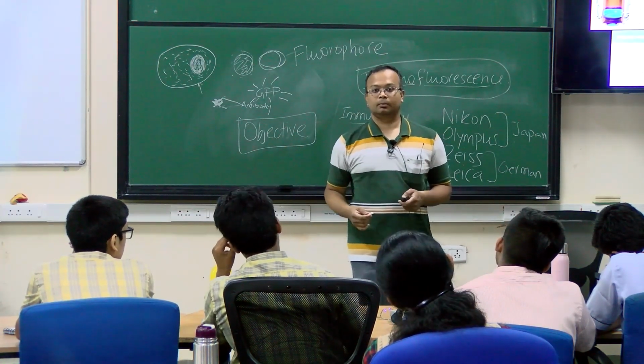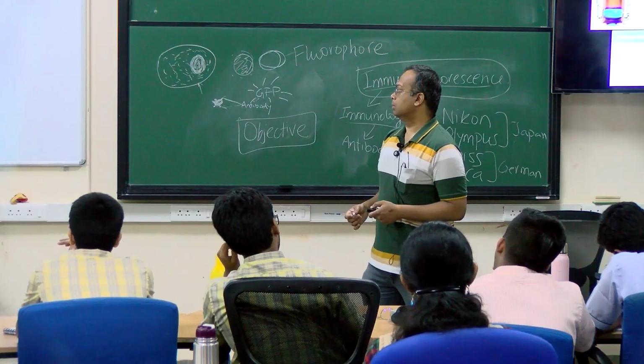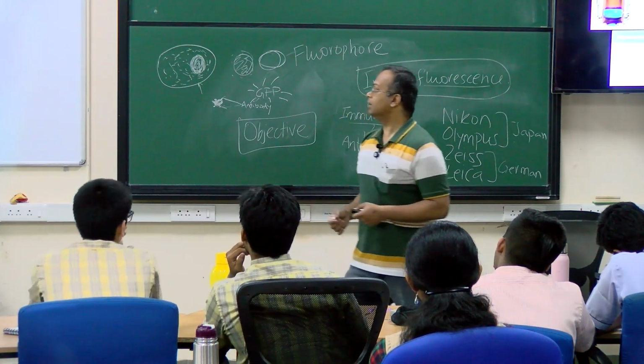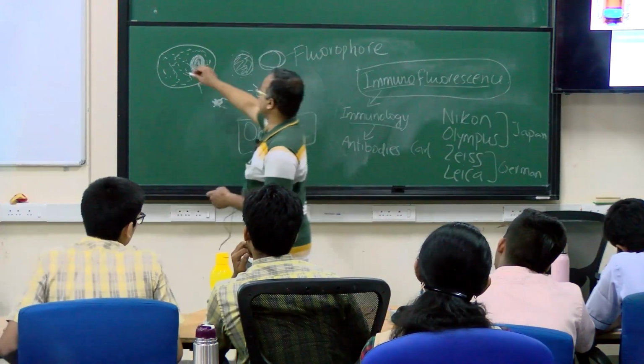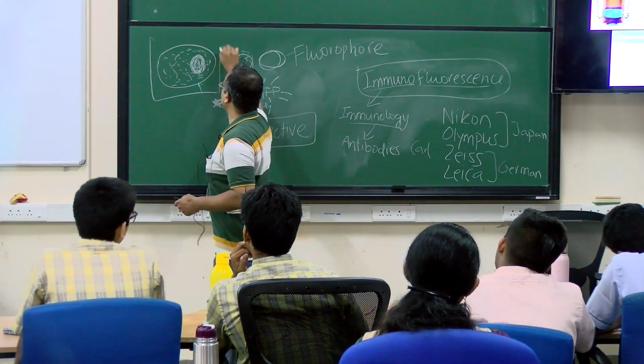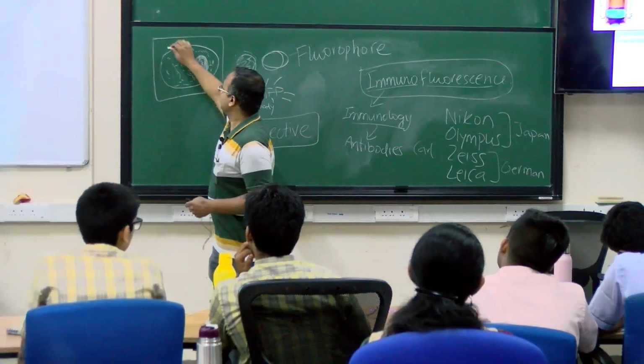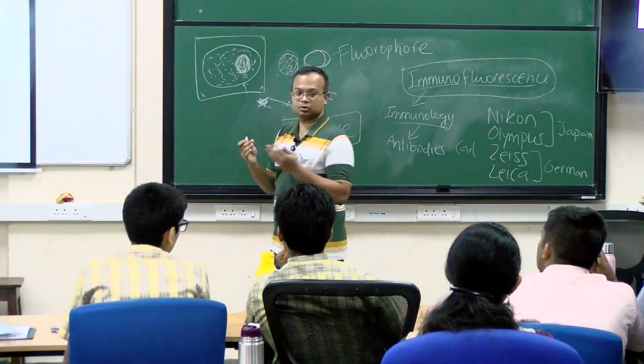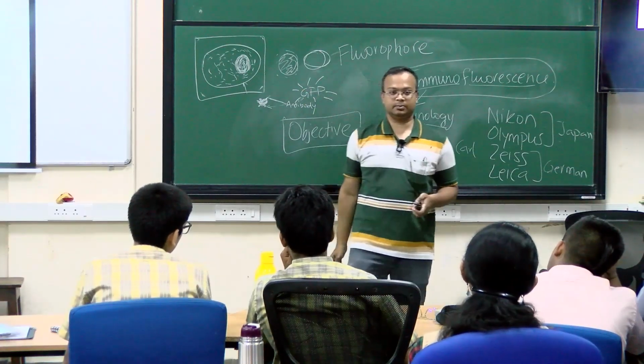Then what is field curvature, sir? Field curvature is about this entire field. If this is your total view, then things that appear on the corner should also appear straight. So that is what is meant.